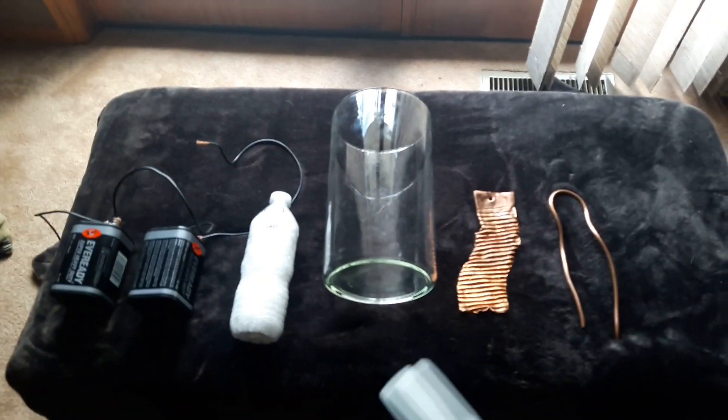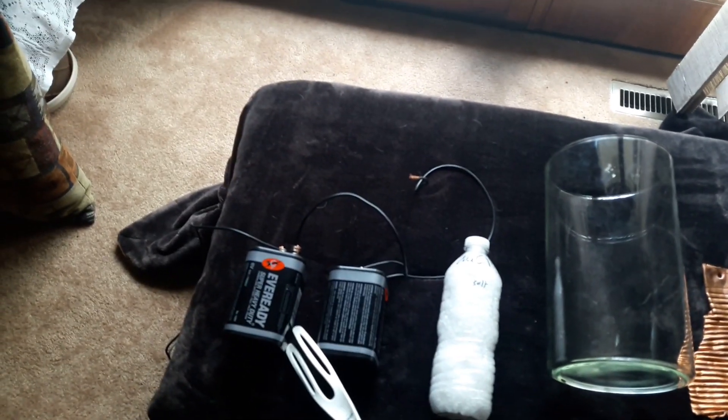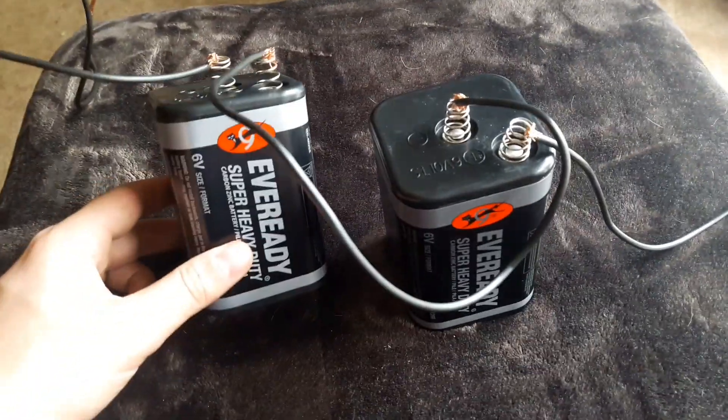What's up guys, this is Deborium and today we're making some copper oxide. Items you need: some copper, a glass reaction vessel, some salt, and a power supply. I made my power supply out of two lantern batteries that I hooked up.